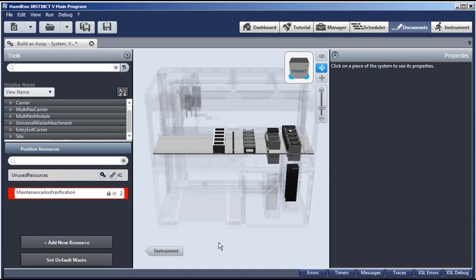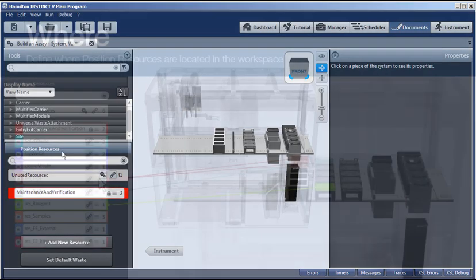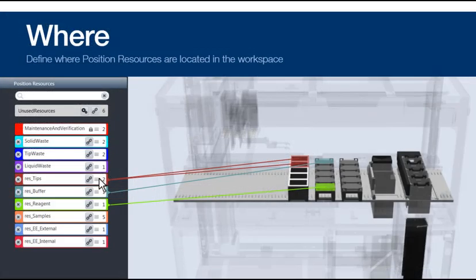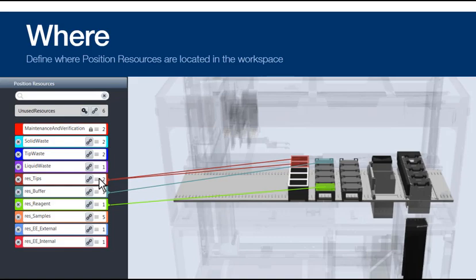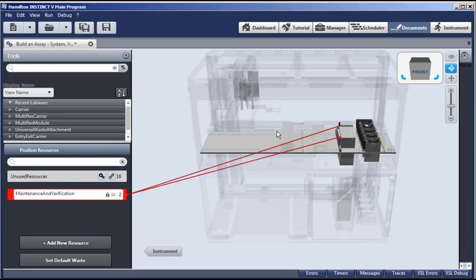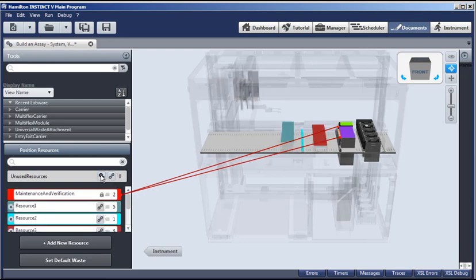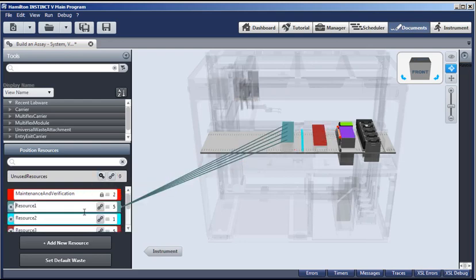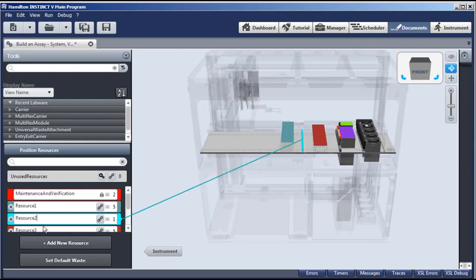So only one more thing is needed. We need to set the position resources for the labware we just added. This will provide unique names and locations where items are located for our assay. Here, back in our workspace, notice that we have two resources already set: Maintenance and verification. And these are used during startup to calibrate the track gripper and the channels. But we can generate all the remaining resources by clicking this icon. Generate resources. And now you can see that all of the other items that we placed are identified and given a default name.